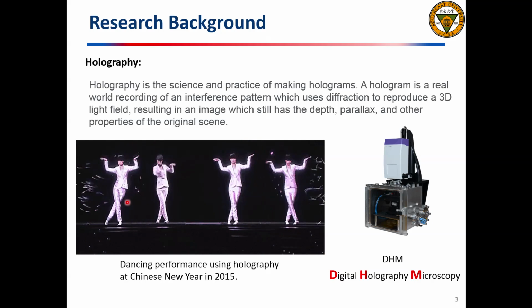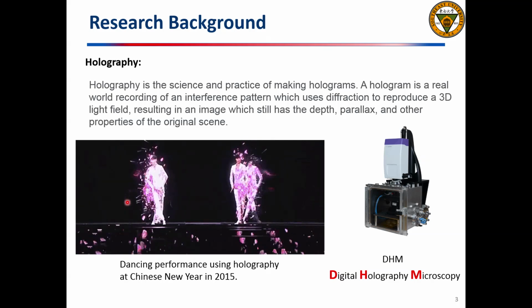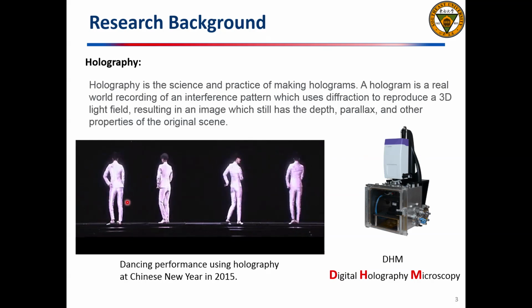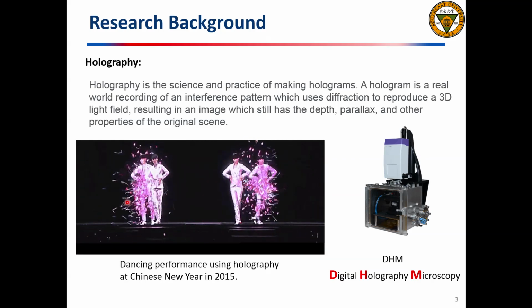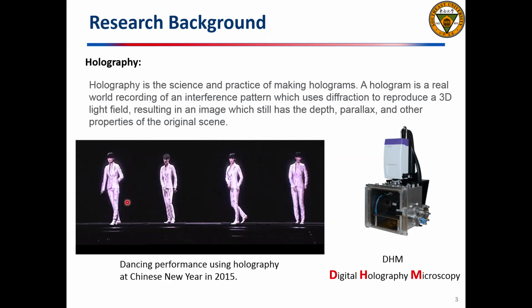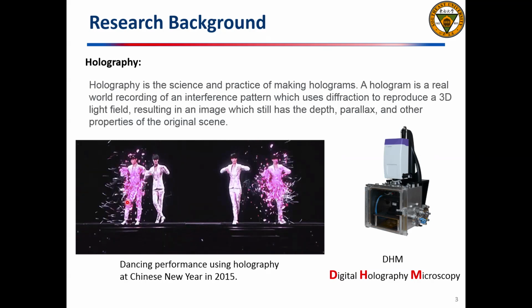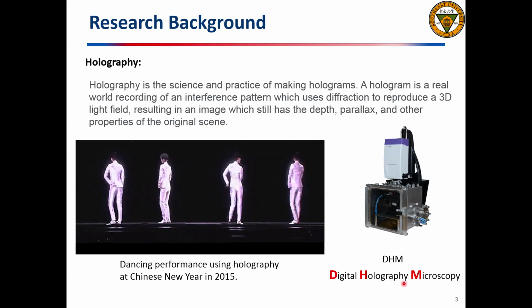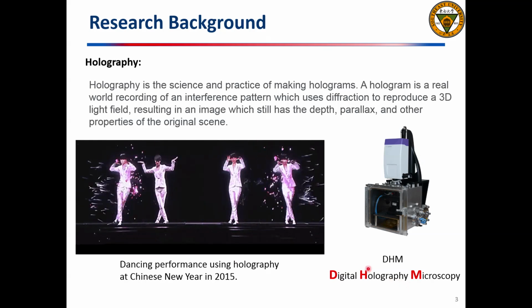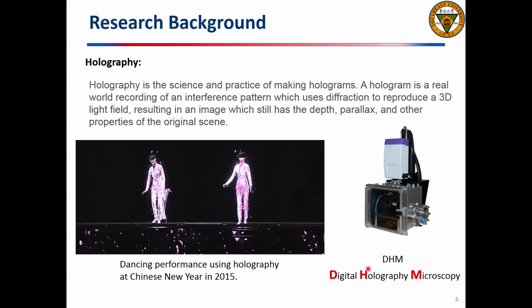Holography is the science and practice of making holograms, and is common in our daily life. A dancing performance at Chinese New Year in 2015 is a good example. In this work, we used digital holographic microscopy (DHM) to observe the dissolution behavior of C3A in water.